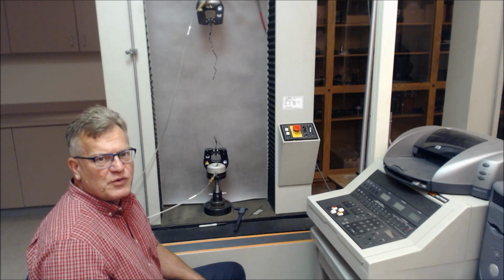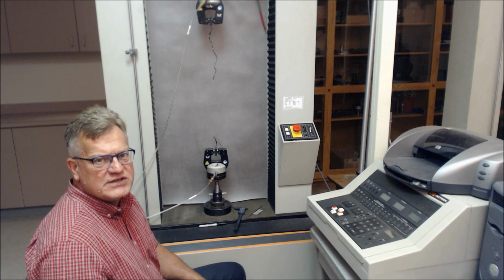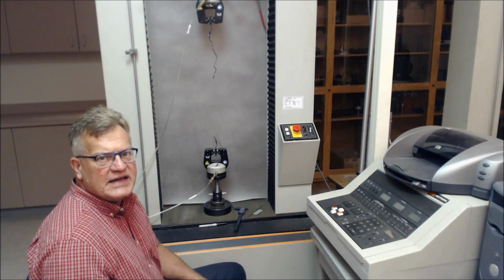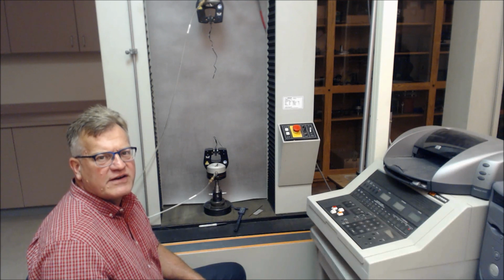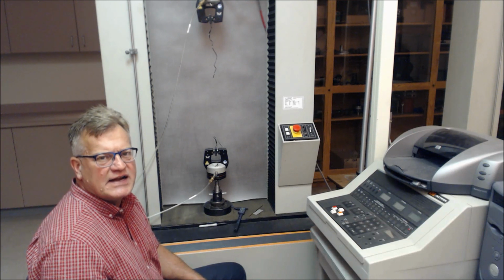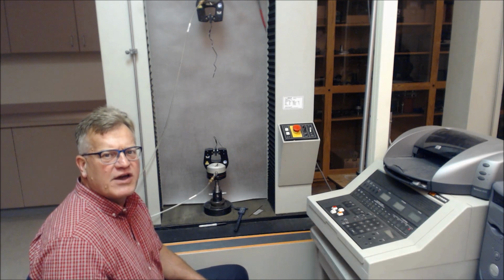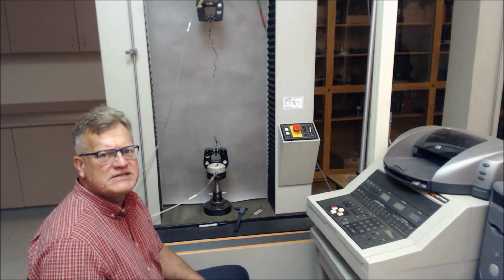The gauge length for break values was 2 inches, and the grip separation was 2.5 inches as per the standard ASTM D6693. Signing out from GSI. All these properties go for GM13 specification.